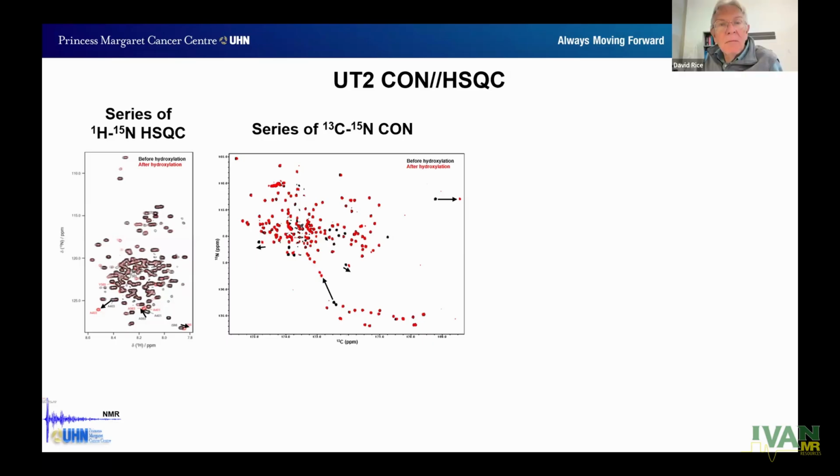You're welcome. Okay. More questions? May I ask a general question? Yes. So, we have a new, actually only a 600 Bruker with the optimized carbon, but we haven't figured out how to use it yet. So how much larger in general can you go in proteins, maybe even folded proteins, when you go to carbon detection?